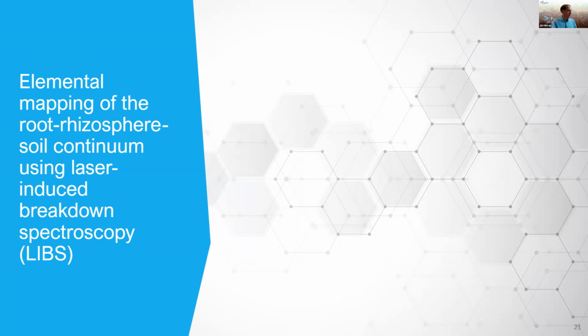And if not, I can go right ahead. So what you've seen is we're trying to acknowledge that the spatial components of rhizosphere are crucial, right? There's so much heterogeneity in soil and rhizosphere. We're trying to develop ways to pull that apart. You've seen our approaches at trying to spatially map enzymatic processes and their distribution in this rhizosphere. We've tried to pull out proteins that we can link to microbial taxonomy and track shifts in the microbial taxonomy in rhizosphere in different spatial locations. We've just looked at a different supply of root exudates to different sections of rhizosphere as well.